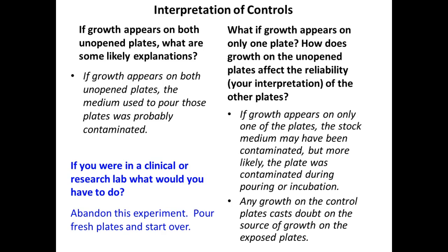Any growth, remember, creates a problem for us on our controls because they're supposed to be negative, supposed to be no growth. Any growth on either one of those plates nullifies our experiment because we don't know, right, if on our exposed plates it came from the exposure or the contamination.